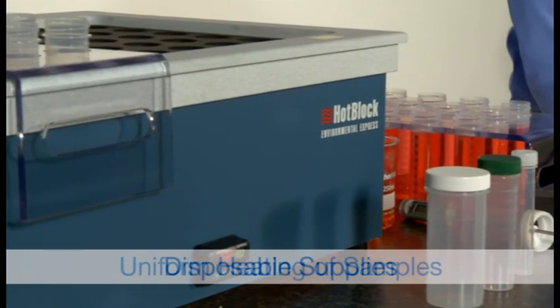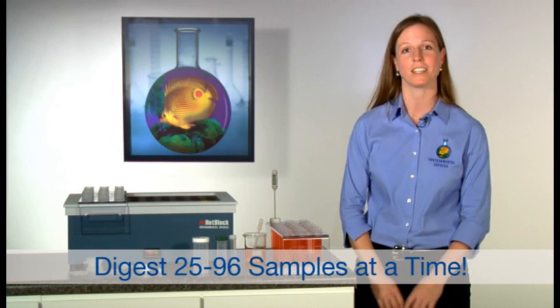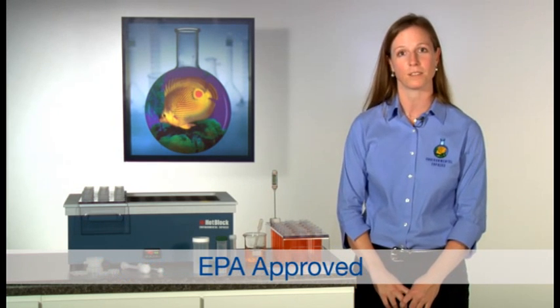The Environmental Express Hot Block provides a uniform heating surface, a corrosion-free environment, and the ability to digest 25 to 96 samples depending on the needs of your lab.